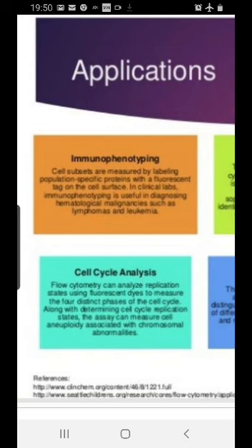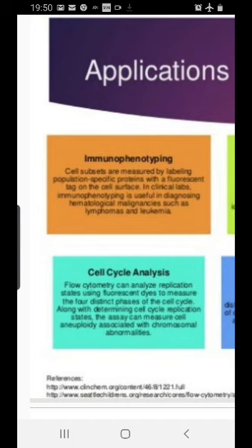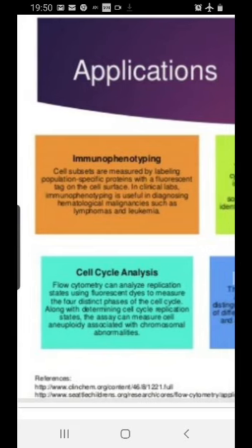But sometimes in conditions like undifferentiated leukemias or biphenotypic leukemias, it's very difficult to understand the morphology. So the best is to send them for flow cytometry. They will put the markers for both lymphoid and myeloid, and then whatever picks it up on the flow cytometry. At a time we can add 6 markers, and we can sort out whether this is a myeloid or a lymphoid, because the treatment is totally different for myeloid and lymphoid.